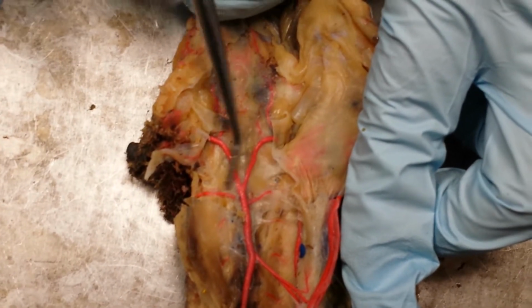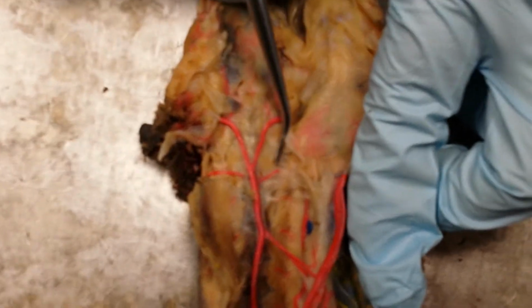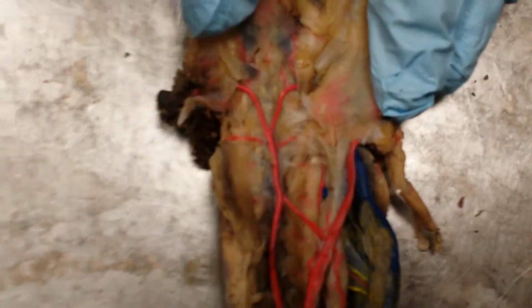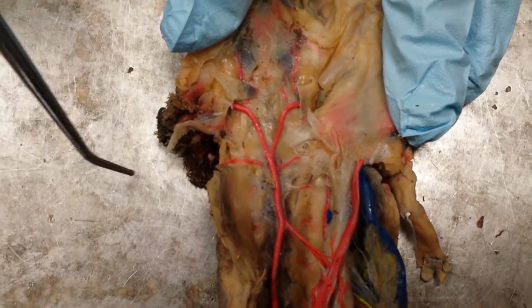The first branch, as we're moving anterior, is called the subclavian artery. The subclavian arteries go out to the arm, so if you are curious and want to dig them all the way out to the arm, you can find them. They're also going to be in your cat.